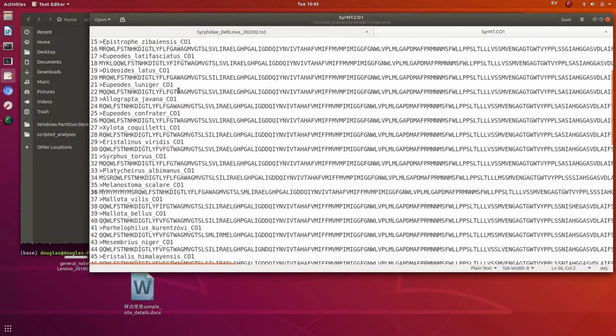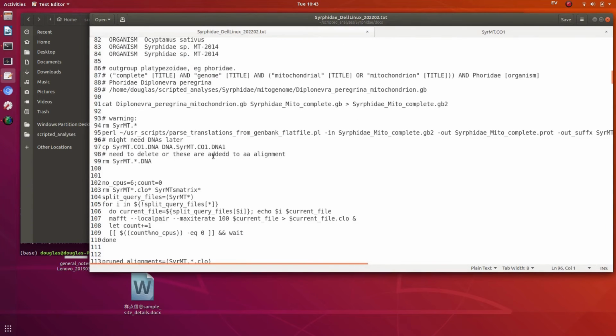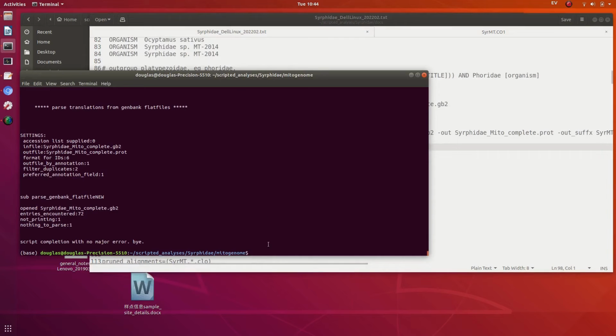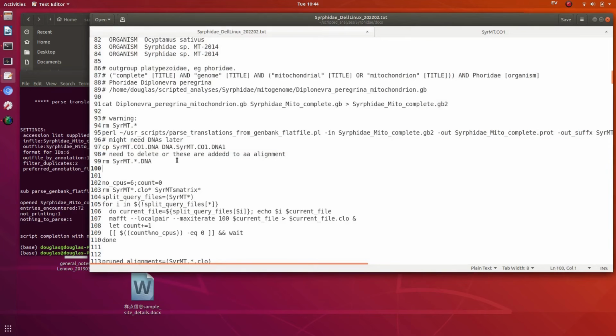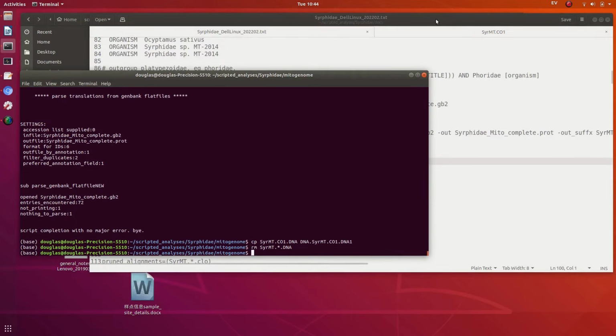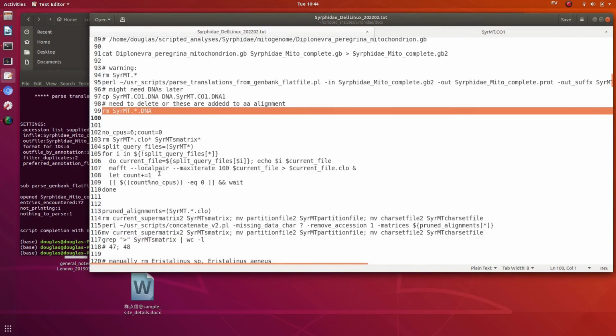This particular script gives the gene name after the species. So one particular file, one particular DNA, I will use it later, so I just keep that here. Otherwise, it can be deleted. So we have protein sequences all sorted according to which gene they are, and now we need to align them.